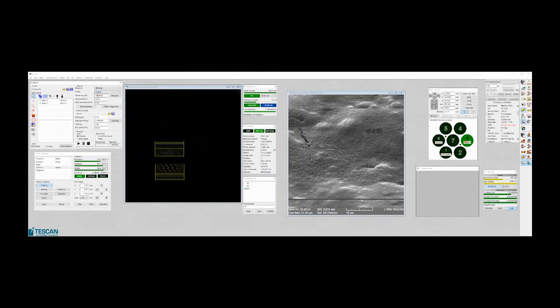Here is the probe current, which characterizes your beam, and then other parameters like dwell time. It's about how long the beam will stay in the same position, overlap, if the 2 places are overlapping, or if there is any bigger gap. It's different for deposition and it's different for etching and so on. And here it's your time and so on.